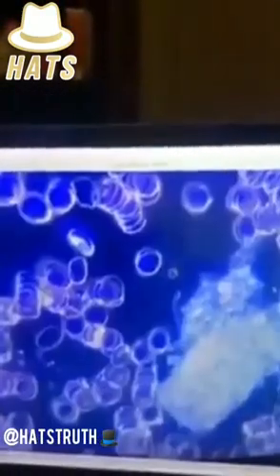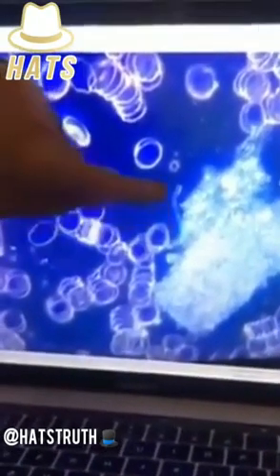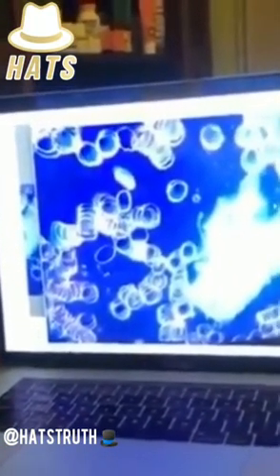Again, okay, what are we looking at? Yes, you see a similar thing, with these things growing out of it. Growing? Yeah, because these things were growing. If you wait another couple of hours, there would be more. They were definitely growing. So they're alive.